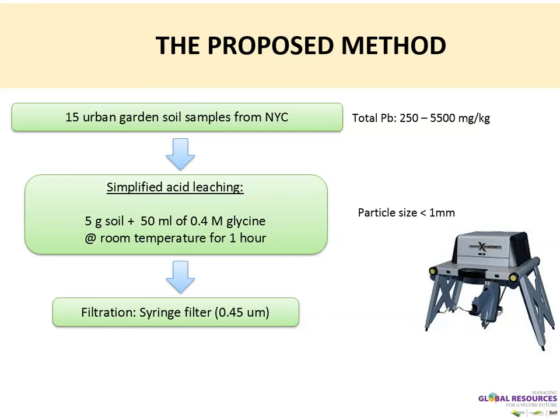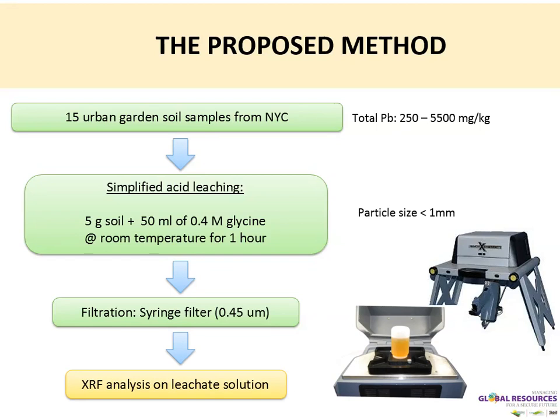Then we filtered our extractions through syringe filters, and we analyzed on XRF. And this is basically what you get at the end, the extracted solution. The volume should be about 15 ml in order to have a good reading. You should also avoid bubbles when you measure on XRF, otherwise it will change the readings.